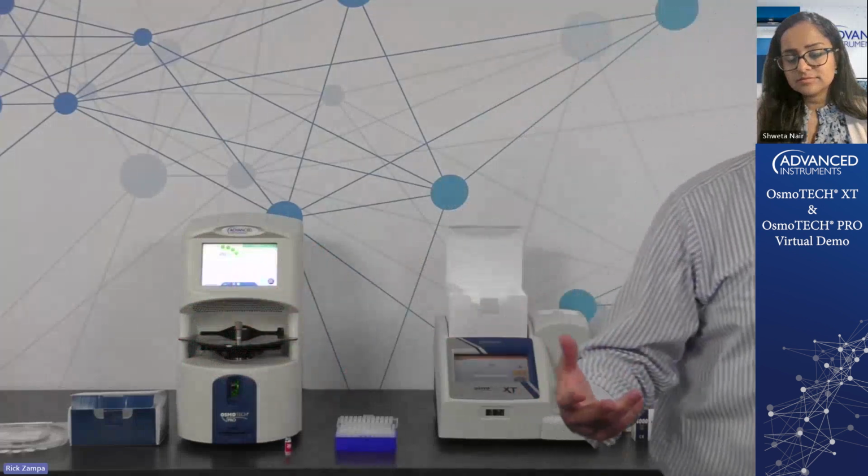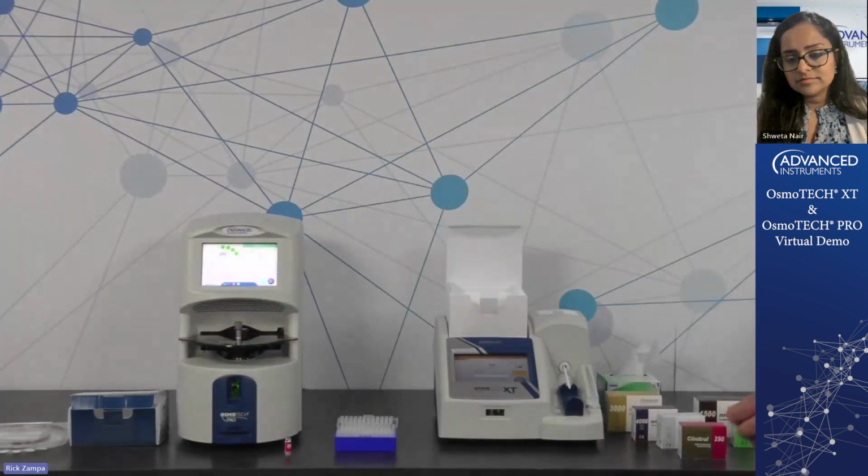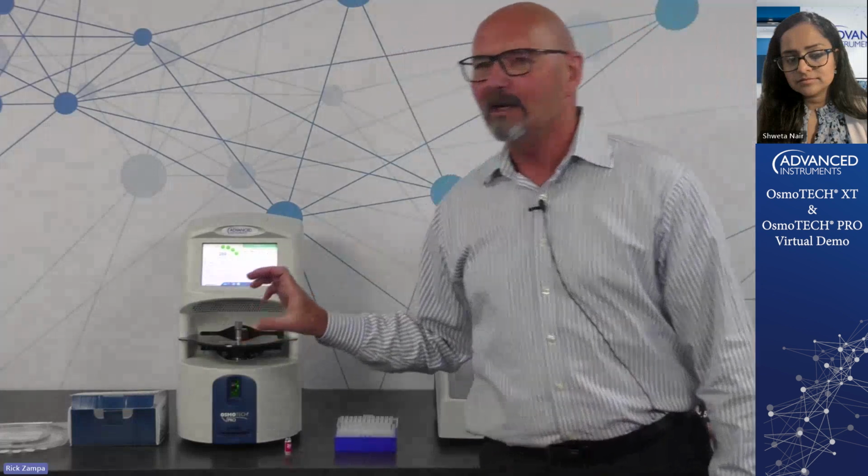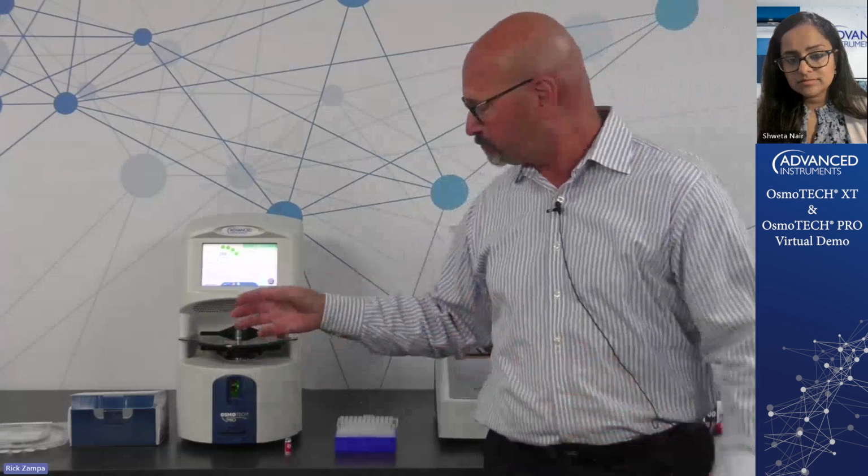The OsmoTECH HT is a 96-well plate-based osmometer. You're using a 96-well microtiter plate as your turntable, for lack of a better word, and you can fill that with your samples. You load that into the instrument, and then it will run those tests out of that 96-well plate for you. If you were running one sample out of each well, it would be about 3 hours worth of testing for 96 wells.